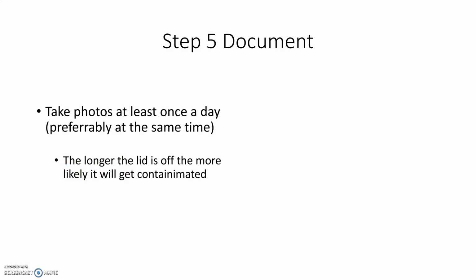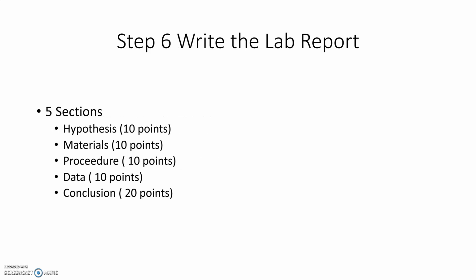Mine took about 6 days before it showed any growth. I'm hoping that if you have it at more of a warmer temperature, it'll work more quickly, or better. Maybe I just have a clean mouth or something. I don't know.